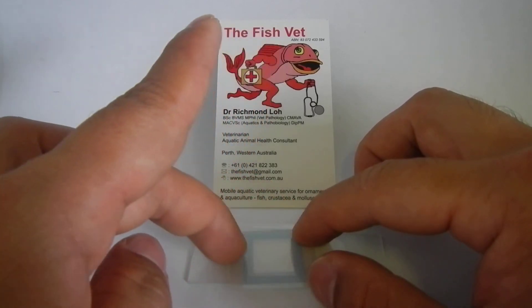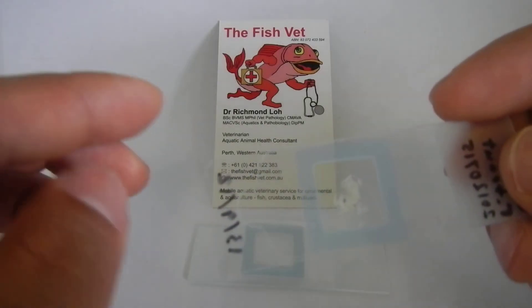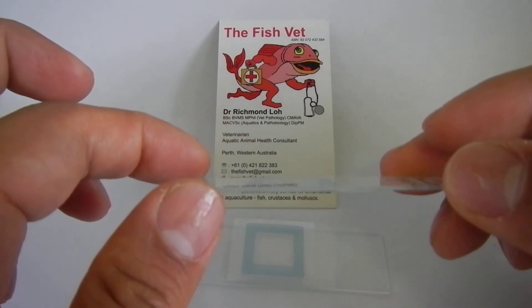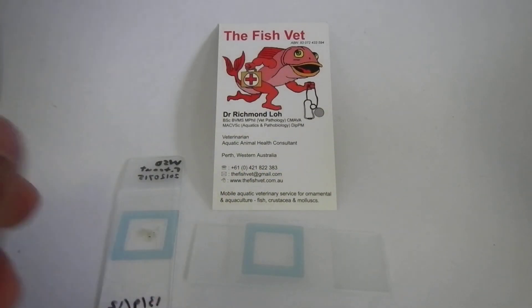Press it all around the edges and there you would have your frame seal slide as shown here. That should keep for probably at least a year until the glue sort of gives away and then the fluid might leak out. So there you go, frame seal slide. Thank you.